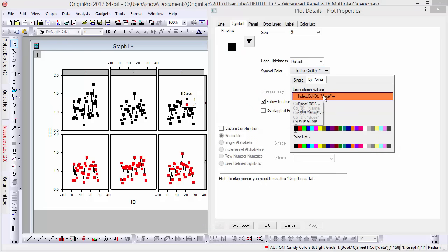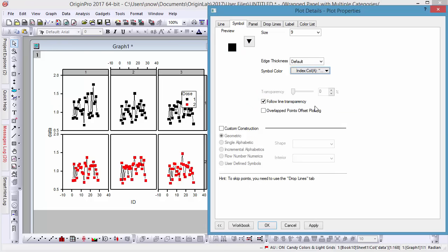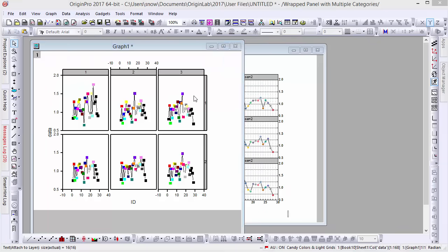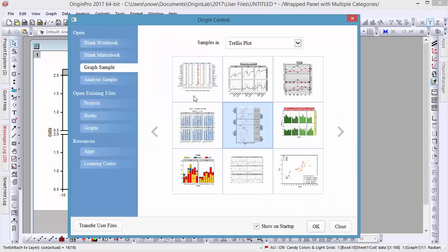This has been a brief introduction to Trellis plots. If you'd like to know more about them and other plot types, you can find many more examples in Origin Central.